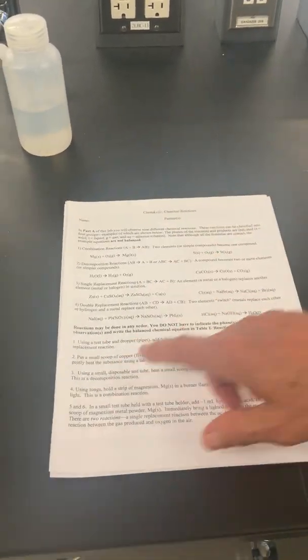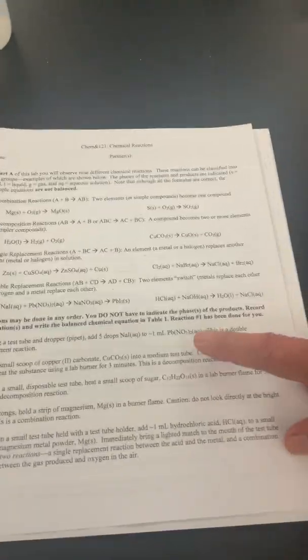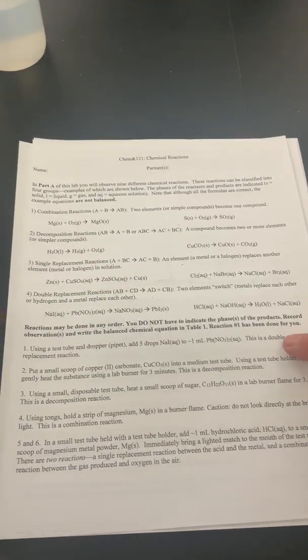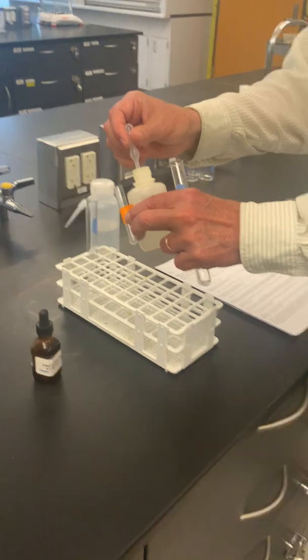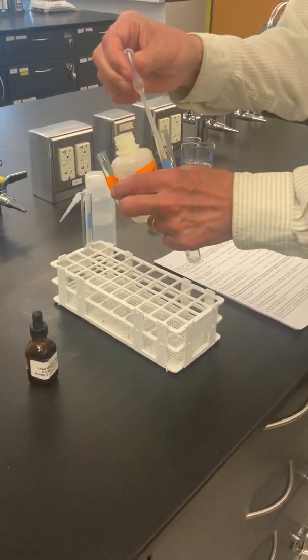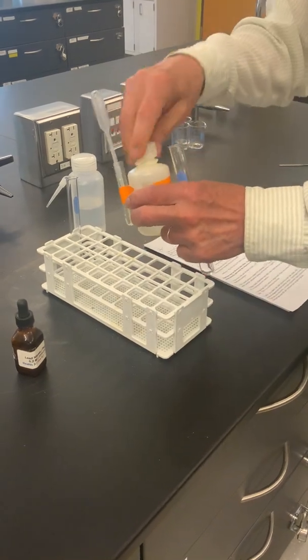Here then, reaction 1, the combination of sodium iodide in aqueous solution with lead nitrate in aqueous solution, a double replacement reaction. In this instance, we use a little bit more than the quantities suggested in the lab, just because I want it to be very visible.